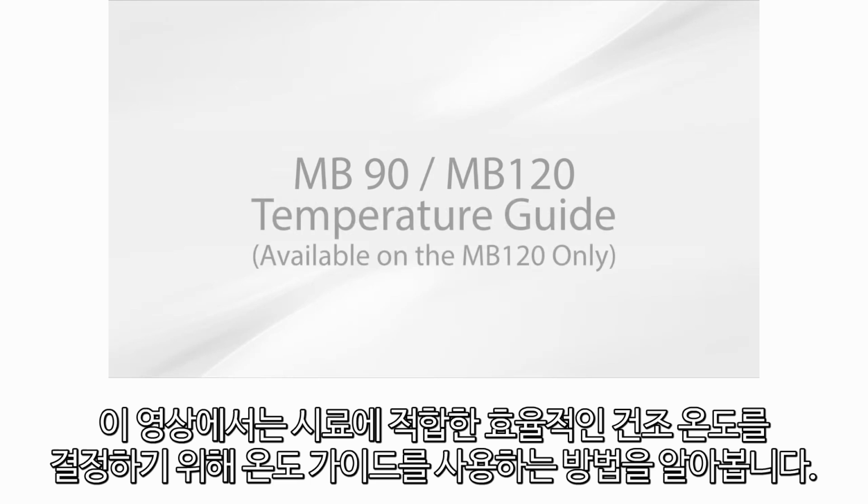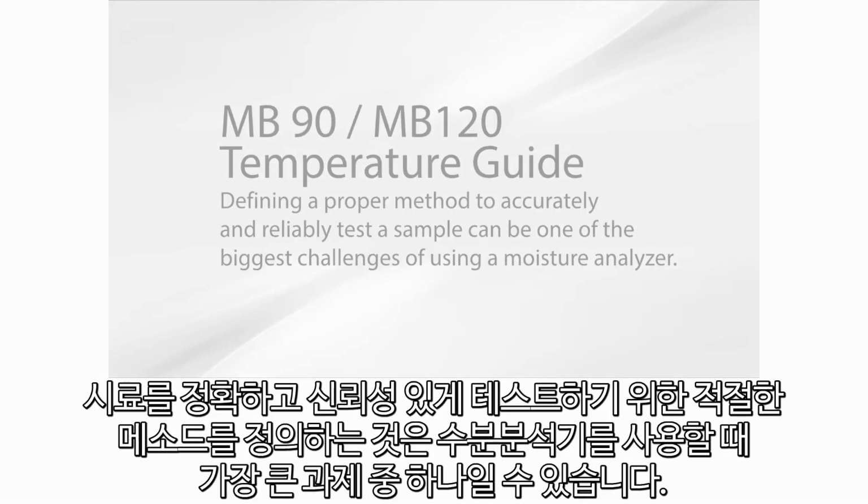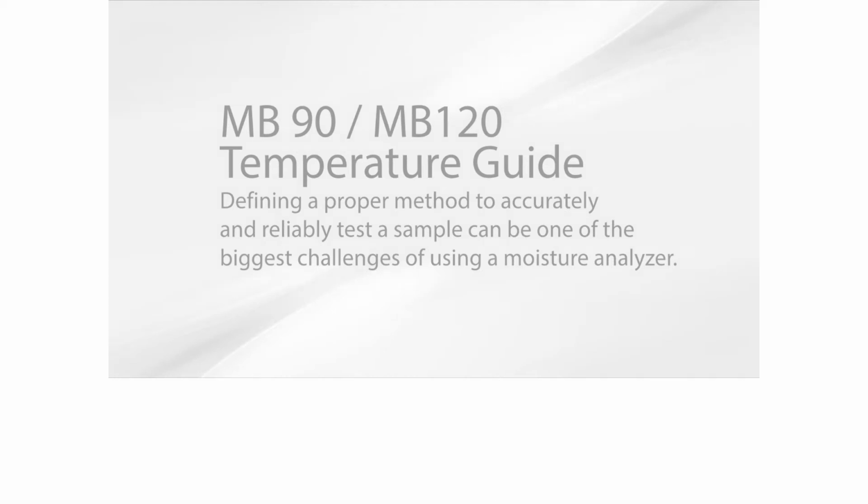In this video, you'll learn how to use the temperature guide to determine an efficient drying temperature for your sample. Defining a proper method to accurately and reliably test a sample can be one of the biggest challenges of using a moisture analyzer.